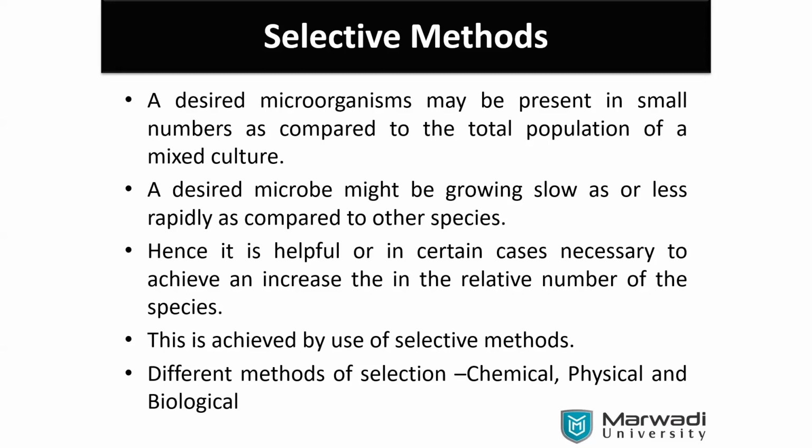There is a mixer in it. Okay, you may take it and just take it out. It's a mixer. Just try to locate what sort of different things are there. Don't open it because it may have fungal spores.